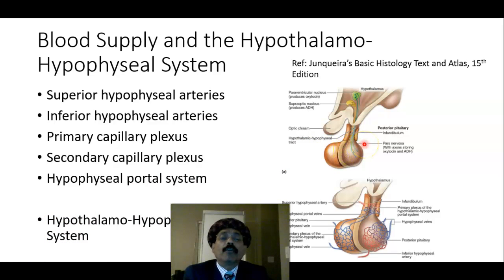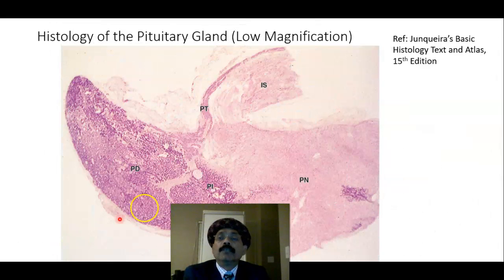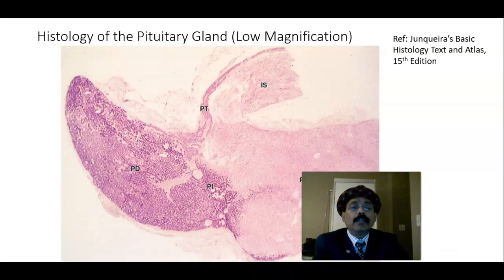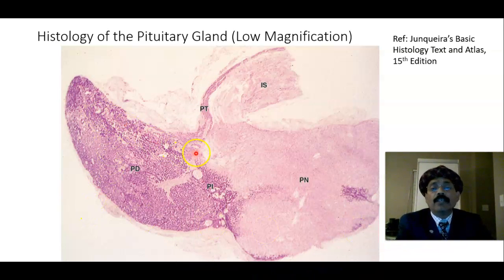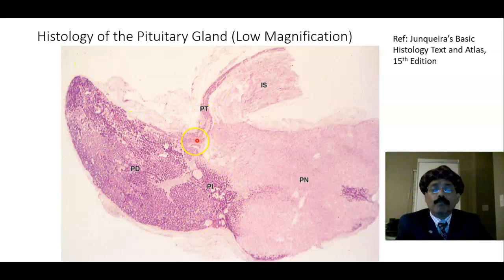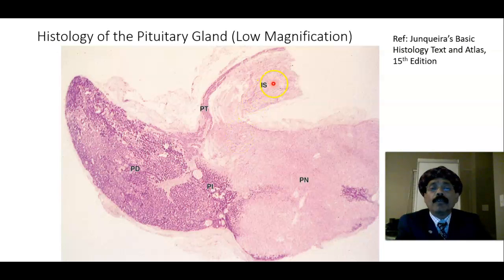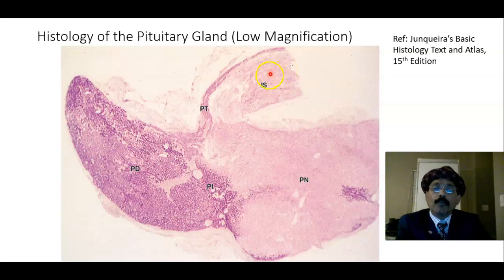The pituitary gland is also called the master gland, and also called the hypophysis. This is a histological section slide of the pituitary gland at low magnification. We have the pars distalis — part of the anterior pituitary or adenohypophysis — the pars intermedia, and the pars tuberalis. This is the nervous tissue; this is the infundibular stalk, and this is the pars nervosa. These are derived from the neuroectoderm from the floor of the hypothalamus.